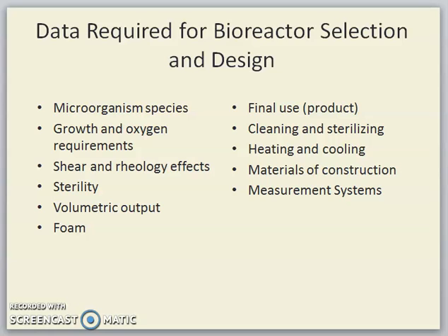And then we need to know the volumetric output and the foam formation. Based on previous studies, we have to do our homework on whether there will be foam formation during the fermentation, so that later when we have production, we can take precautions. And we need to know the final product of our fermentation. The cleaning and sterilization, again on sterility, and the heating and cooling system, because of the temperature required.